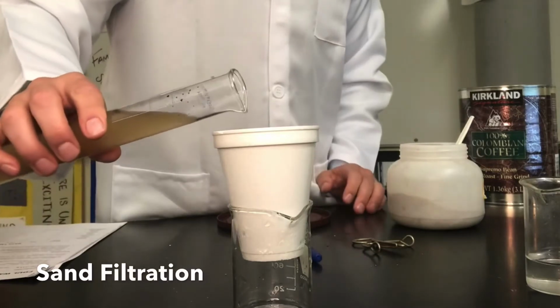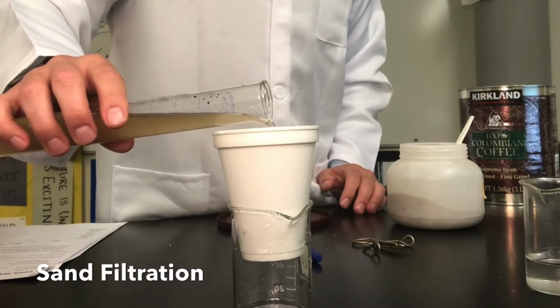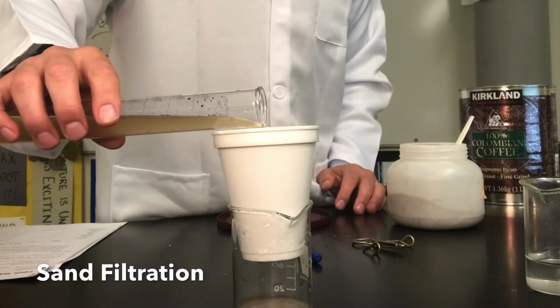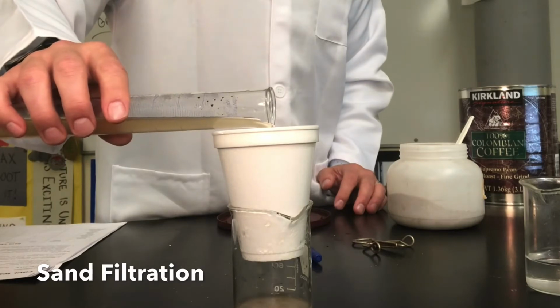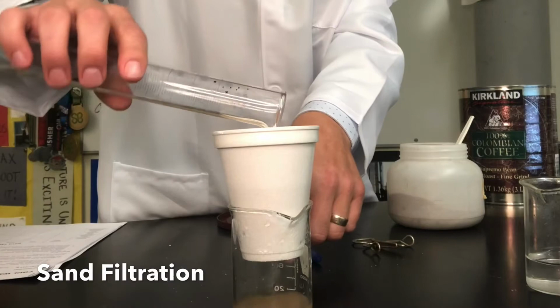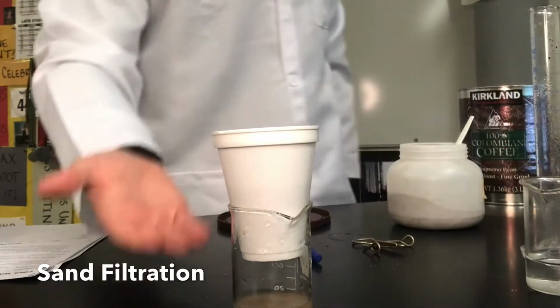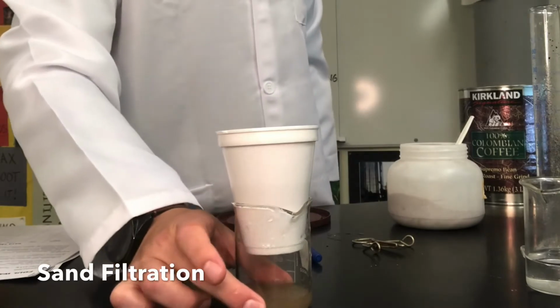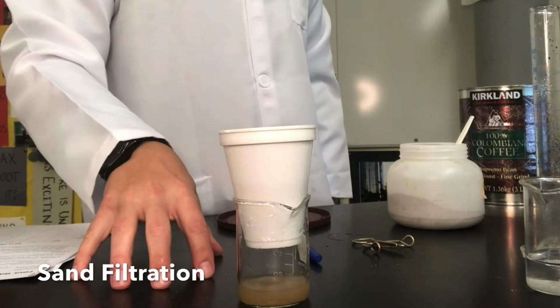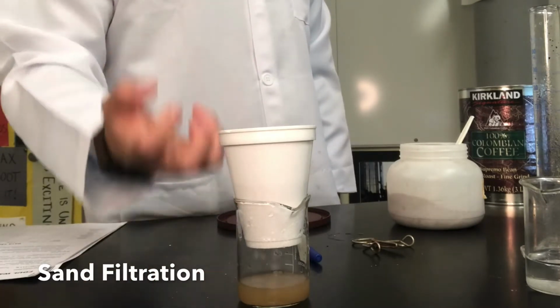So now we have our layer of gravel, layer of sand, and some holes at the bottom, and I'm going to slowly pour our dirty water into this sand trap. And you can start to see, hopefully on the bottom a little bit, some of the water coming through. Now what this sand and gravel filtration is going to do, hopefully you can see that the water's coming through. Even though it still looks brown, it's slowly starting to pull out the little pieces of solids.